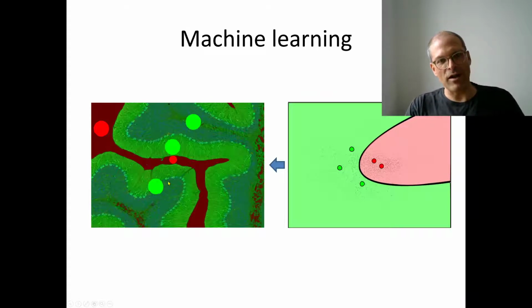And you see that it does a decent job of foreground background segmentation, but not perfect. You see there are a few things which are marked as background, even though they should not be. And well, the reason is that, and I've kept this on purpose, such supervised machine learning algorithms only ever know what you have taught them.